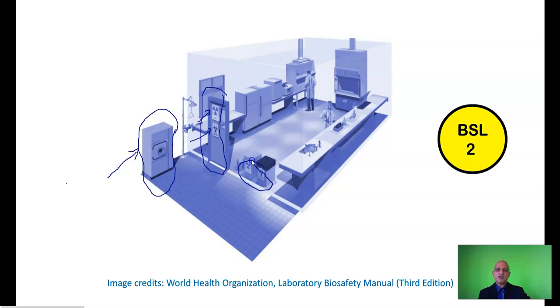Now, this depends on your specific lab. Are you working with radioactive waste? Then you need to ensure that there is a radioactive disposal container here with the proper precautions, such as the thickness of the wall, etc. And as you can see, these are the personnel working over here in the lab.